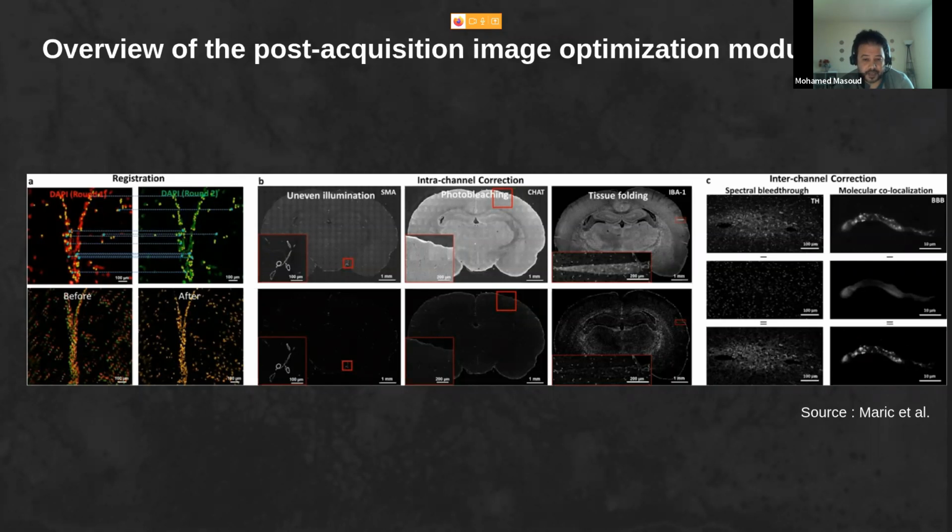So they used a semi-supervised sparse linear spectral unmixing approach, which I guess is like a type of independent component analysis to separate the signals of the two sources.